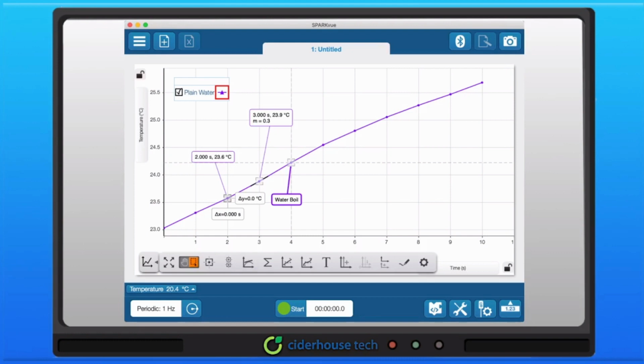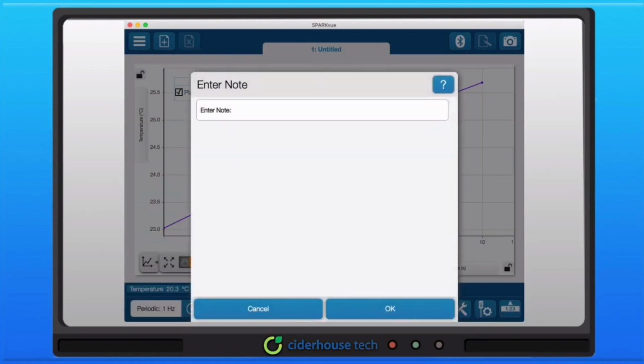The reason for skipping some analysis tools was to now demonstrate that the Coordinates tool, Slope and Annotation tools have a shortcut. Just click on any data point on your graph and you get the choice of those three options. Here I will just place some random text, to demonstrate the process.